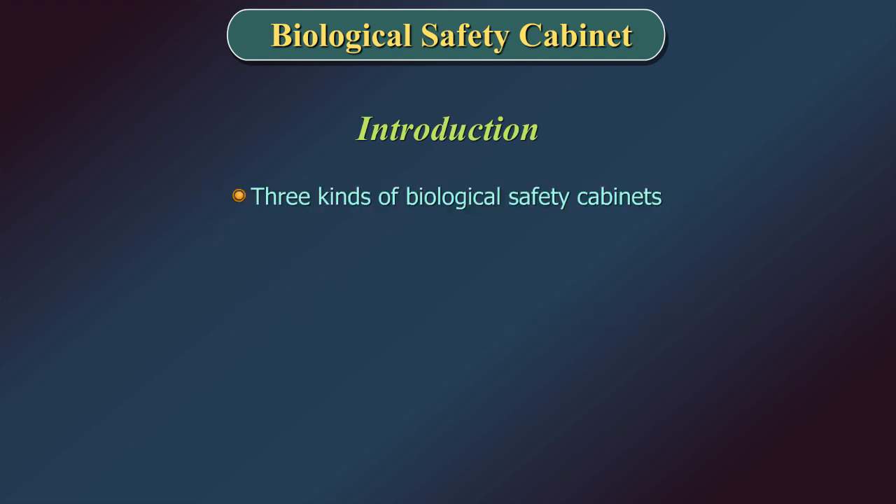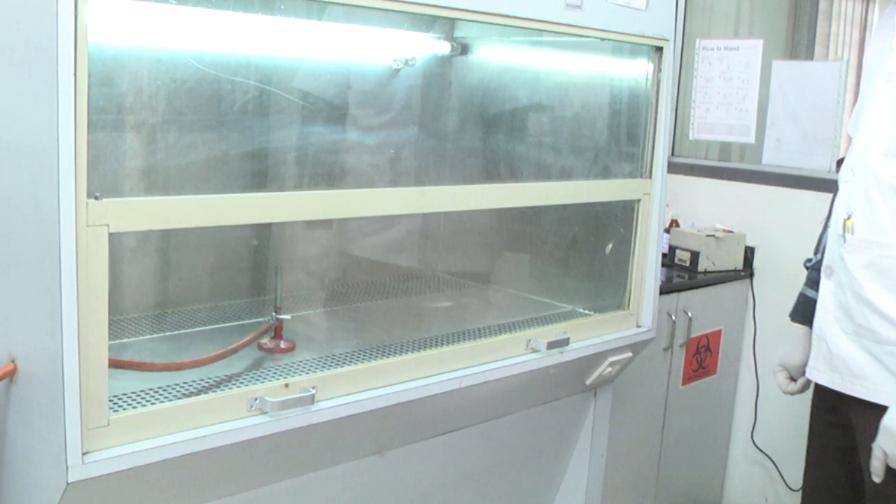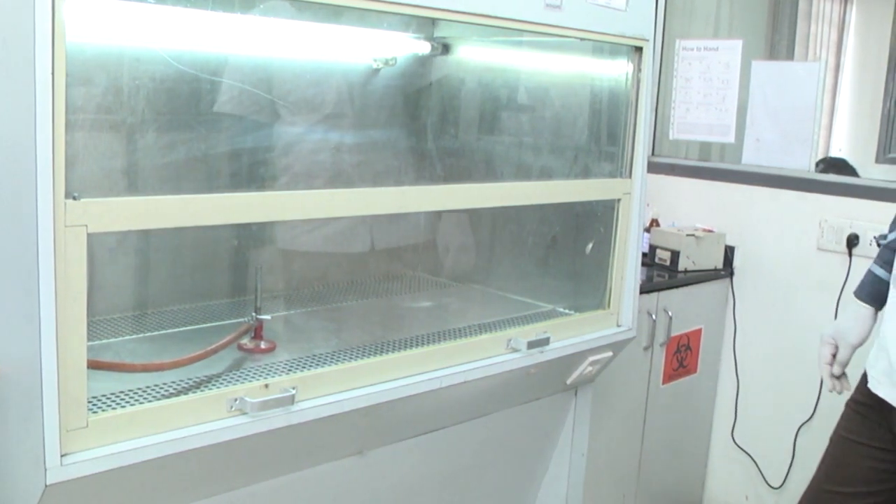Three kinds of Biological Safety Cabinets, designated as Class 1, 2, and 3, have been developed to meet varying research and clinical needs. The Biological Safety Cabinet is a chamber generally constructed of steel.